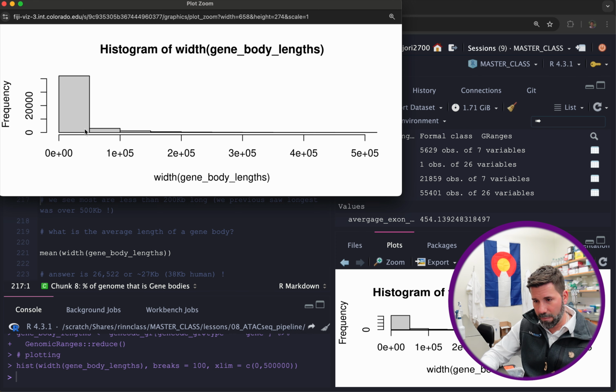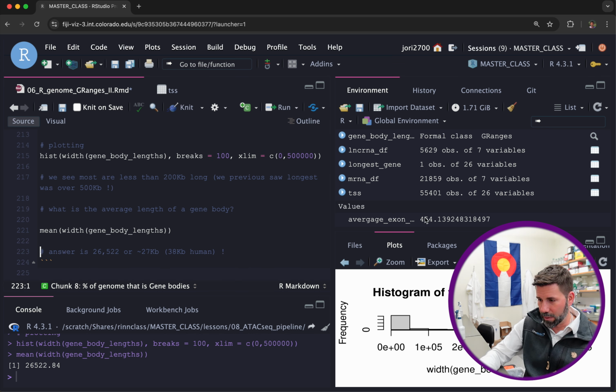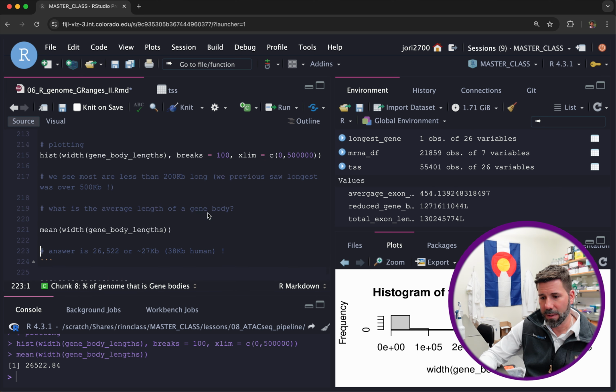And we can see roughly the same thing, except for around 10,000, and we can get that actual number. Let's see how close I was with, oh, here it is, 26,000, so it was under by half this time. Okay, that's it. So there you go.